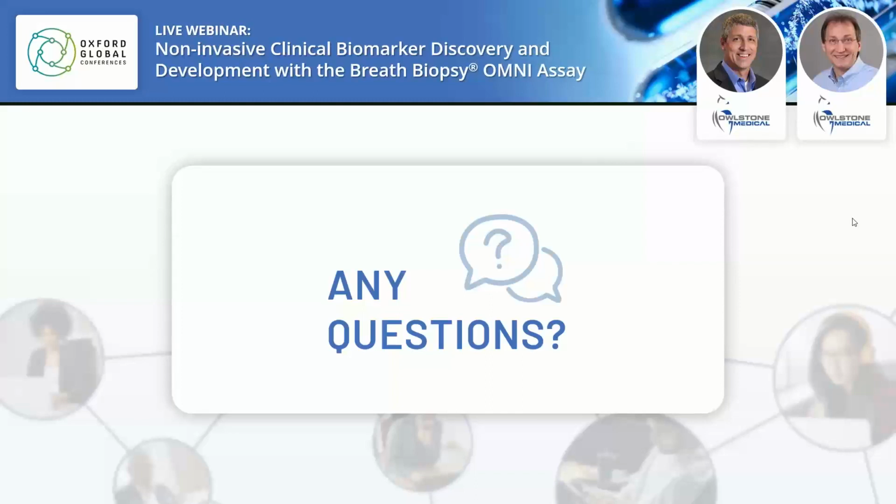Great, thank you. And next question: alkanes have been a mainstay of retention time indices in GCMS for decades. If alkanes and alkenes have biological importance, what are you using to standardize retention time?